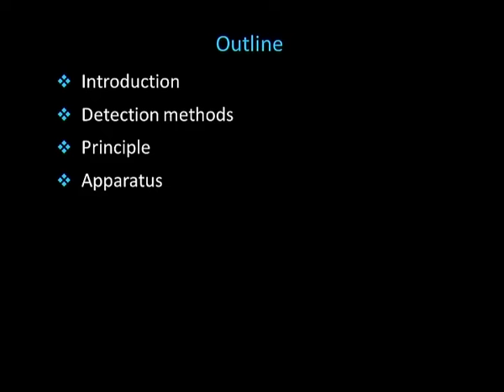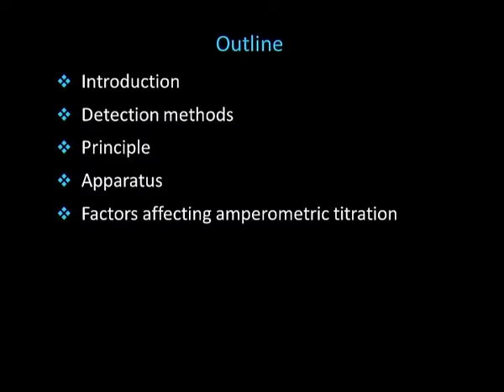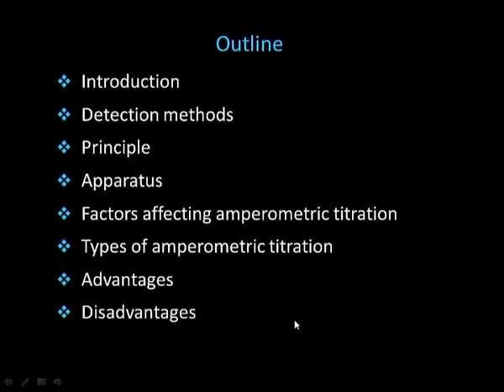The outline of the lecture will be introduction, the detection methods, principle of the technique, apparatus used, factors affecting amperometric titration, the types of amperometric titrations, advantages, disadvantages of amperometric titrations, and then applications of amperometric titrations in industries.